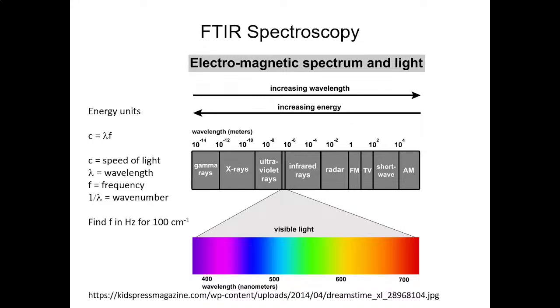Infrared is less energetic than the visible spectrum, beyond the visible red, and that means the wavelengths are longer than the visible. It's actually a pretty wide band compared to visible, so a lot of the infrared that people talk about depends on what they're doing with it.